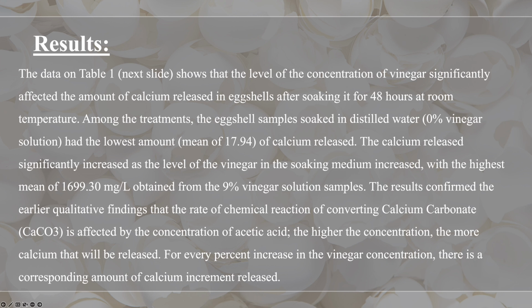The results confirmed the earlier qualitative findings that the rate of the chemical reaction converting calcium carbonate is affected by the concentration of acetic acid. The higher the concentration, the more calcium that will be released.